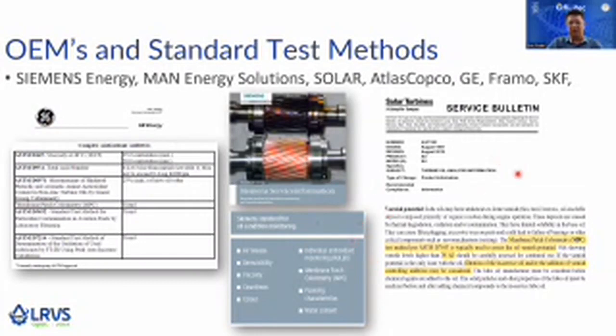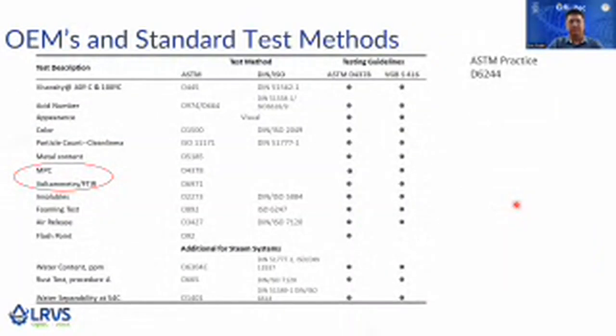And then this is from Solar Turbines. They also mention the same, the MPC. As well, I know the latest service bulletin already recommends running the LSV as well. So these are the OEM standards and the standard test methods. You can get most of these from OEM laboratories.